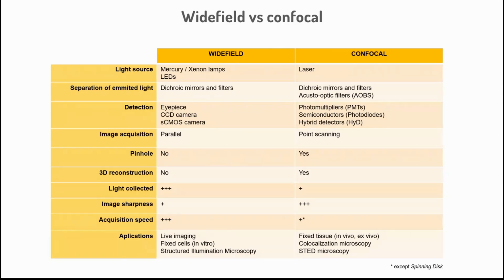And this is important because if you understand this, then you will understand why we need to use two-photon for some applications. So you use a laser because the light that you collect is very little, because it's filtered through the pinhole. So it means that you have to provide to the system much more energy, and this is why you use the laser, so you can collect at least something through the pinhole, right? So this is according to the light source.